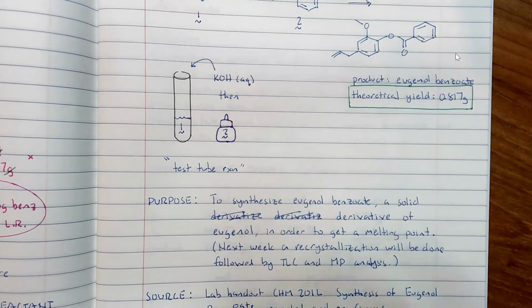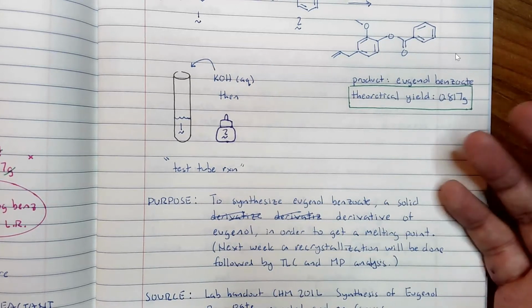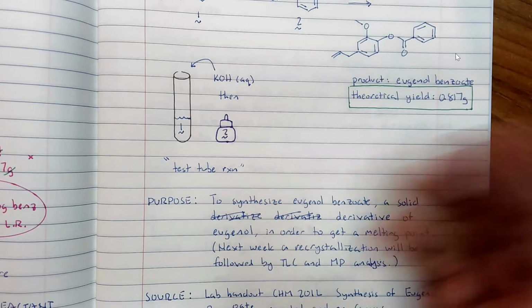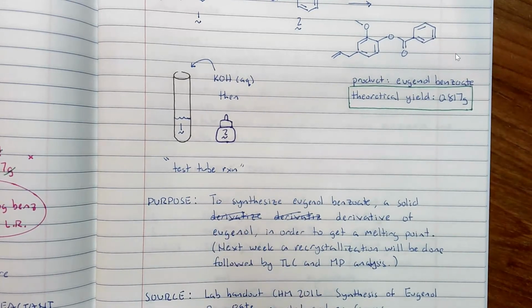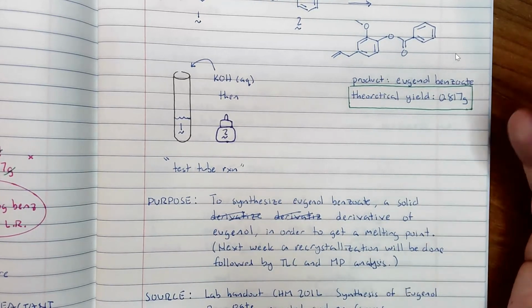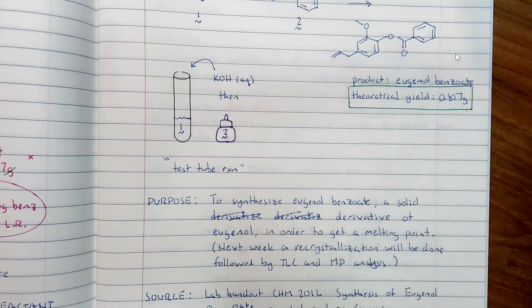You're sharing your lab notebook with future scientists who are going to be in the lab. You don't want to hide anything, even if it's an honest mistake like a typo. You want everything to be visible for the next person, just in case they want to reproduce your experiment.